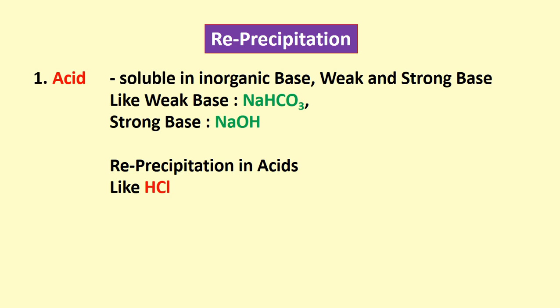Acid is reprecipitated in acid, like hydrochloric acid. It is soluble in NaOH or bicarbonate and reprecipitates in acid. So acid is soluble in base but reprecipitates in acid.